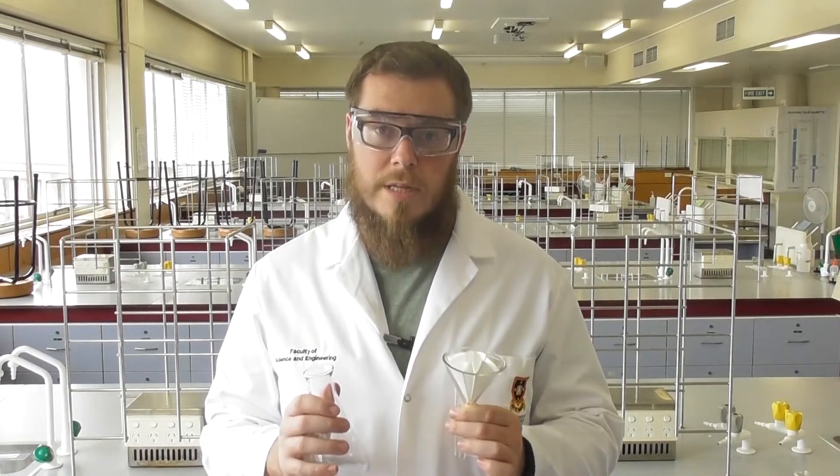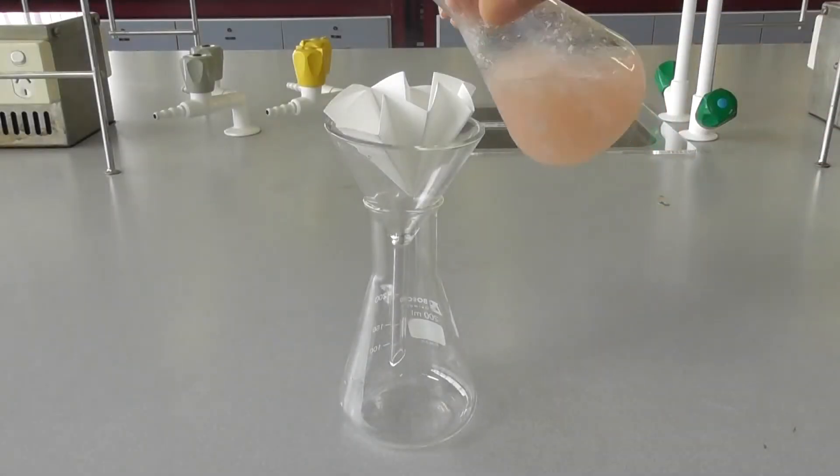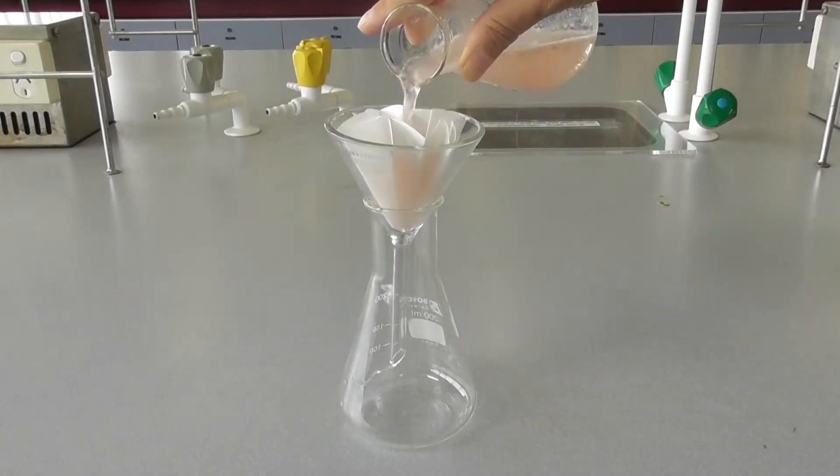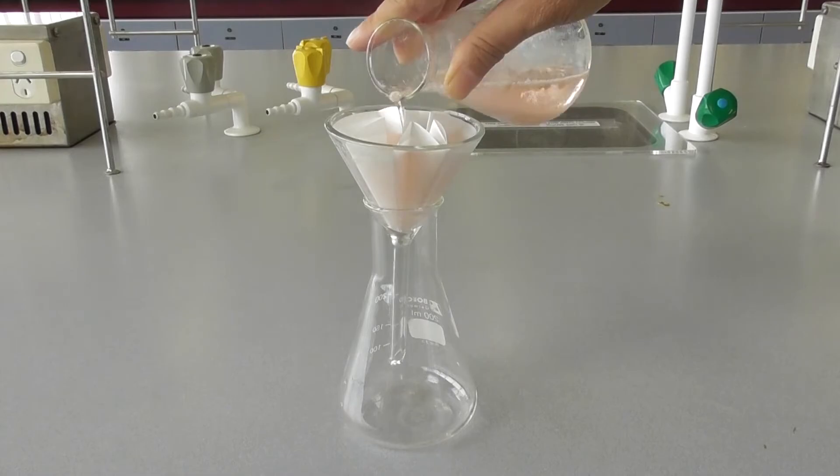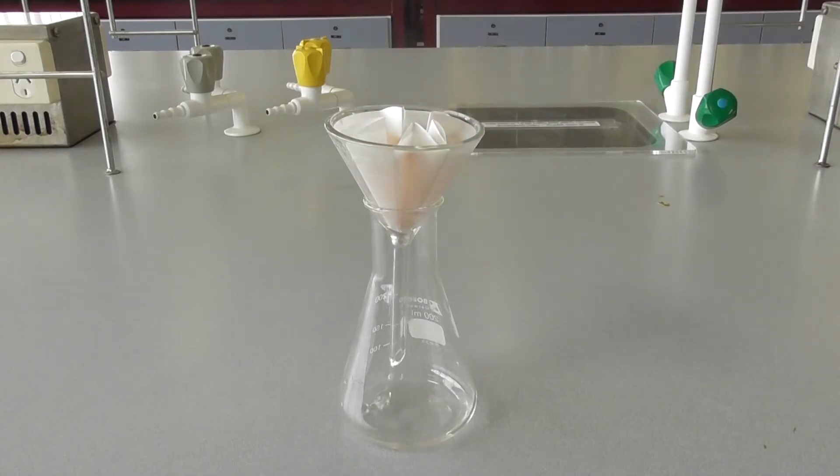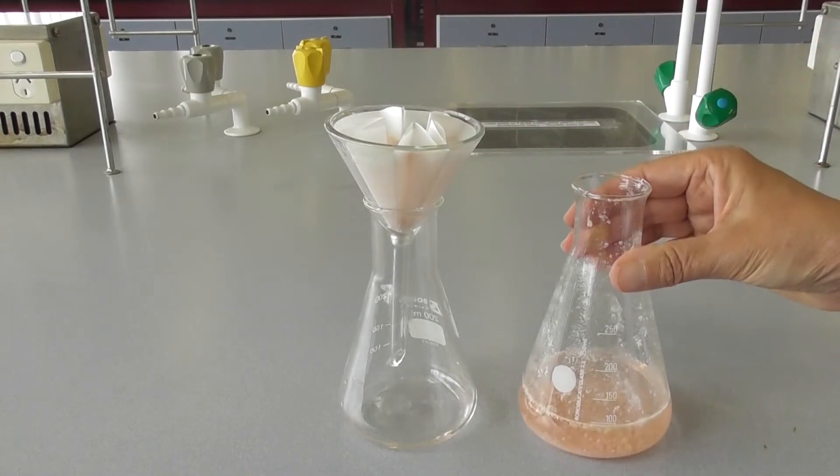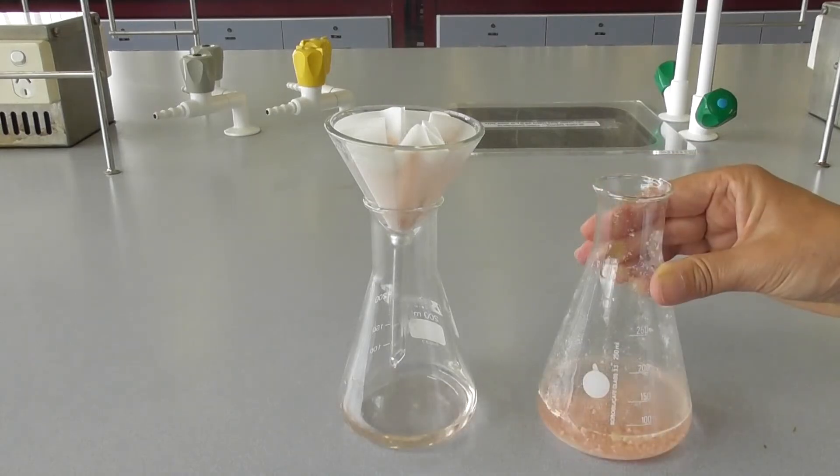In this video, we're going to show you how to carry out a gravity filtration. Gravity filtration is a method of filtration where a liquid is drawn through a piece of filter paper under its own weight. This is generally used to isolate or collect a liquid, removing solid impurities.